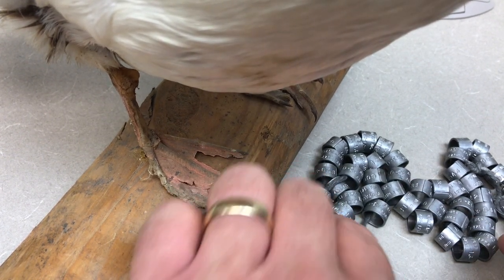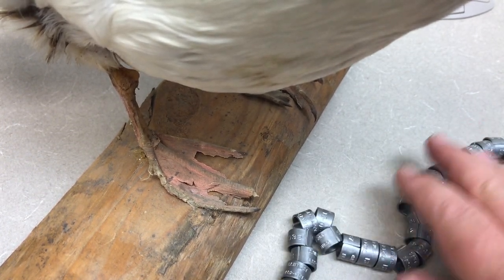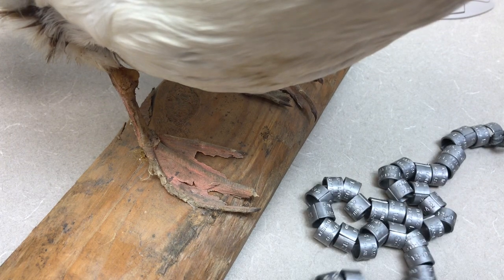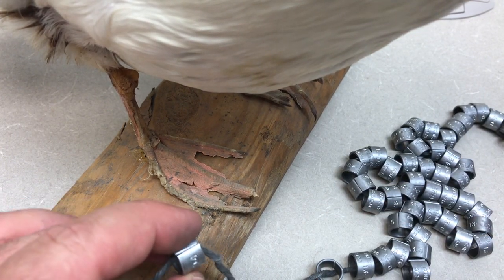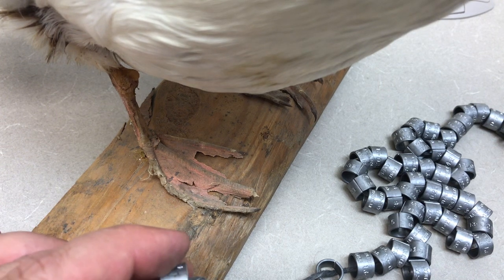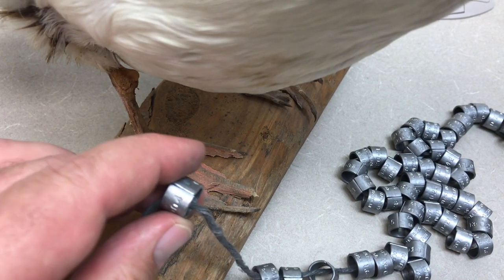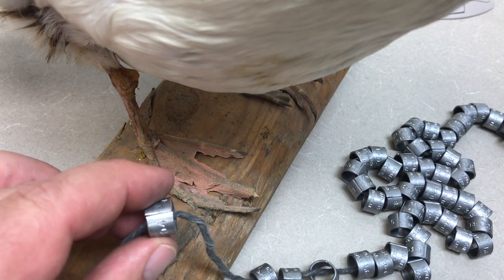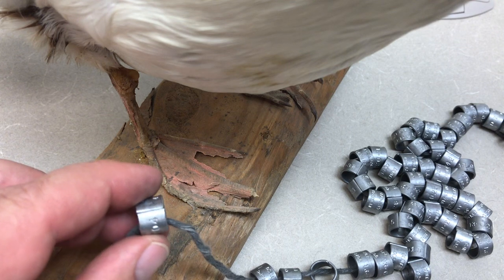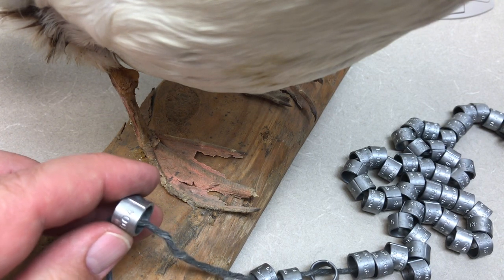The other string of bands I have here contains around 100 aluminum leg bands. These are the standard go-to type of leg band that you're going to use on anything from a hummingbird to a swan, and they're sized appropriately for each sized bird.